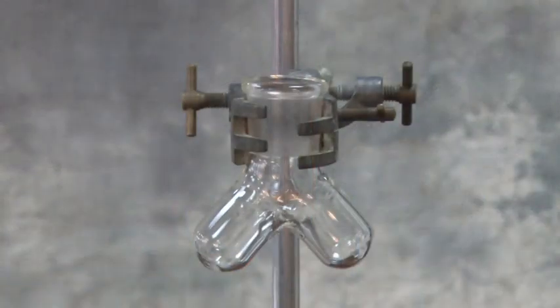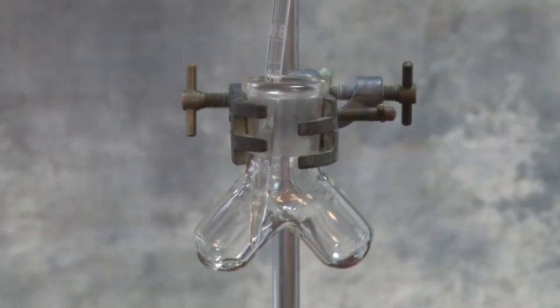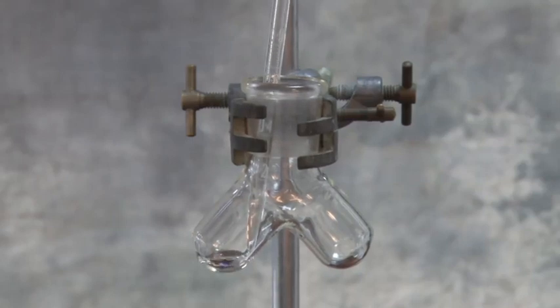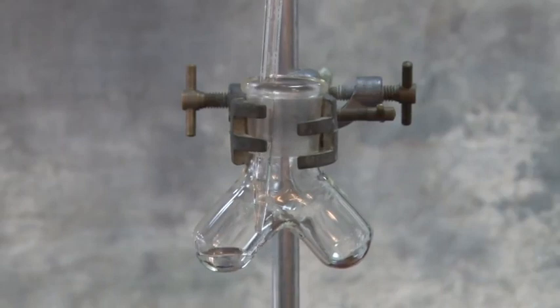So now here is our reaction vessel. We have two chambers to the reaction vessel. Into the first chamber, we're going to put our hydrogen peroxide solution. We're going to put in 2 cm³ of this hydrogen peroxide solution. We're going to pipette it in, and make sure we get every last drop into the reaction chamber.